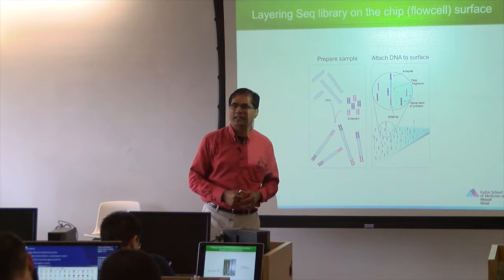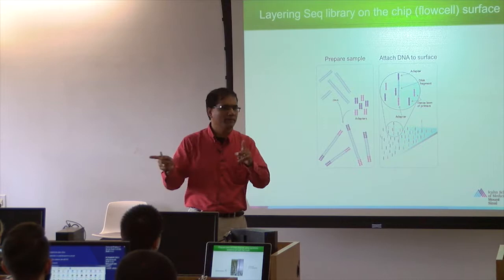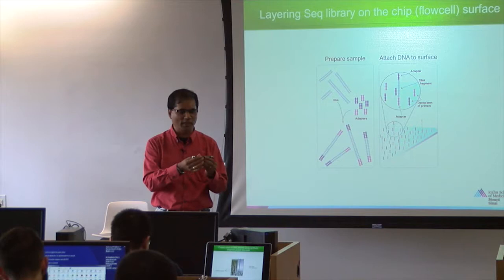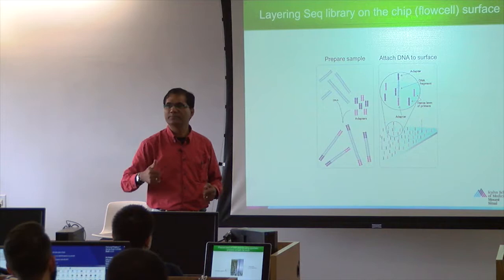And these guys started improving on that. Right now, how many can we sequence in that one slot? Right? How many? Any idea? Approximately, we can go up to 350 million. From 1 million sequencing, we can sequence up to that in one small chip slot of this size, like a microscope slide, literally. We can have 3 slots on that, like a gel, 8 slots on that, like a gel. And each one, we can sequence up to 350 million.